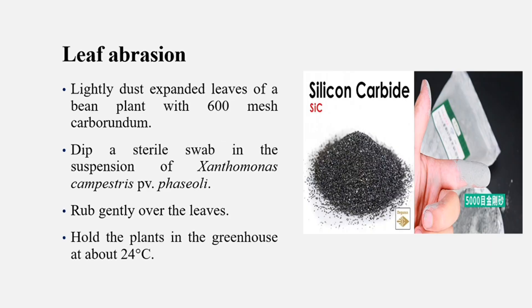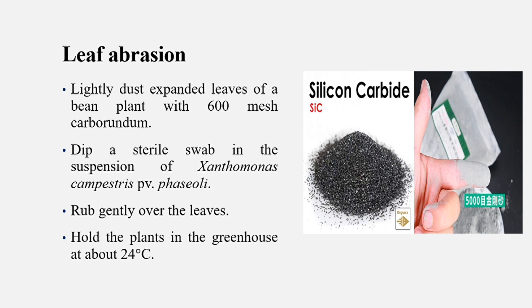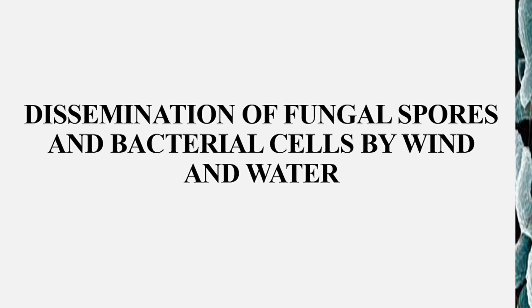The last method is leaf abrasion. We use mesh carborundum, which is silicon carbide, as an abrasive for cutting and gliding on the leaves. We then take a sterilized swab, dip it in the Xanthomonas compestris suspension, and rub it on the leaves. We put the plant in the greenhouse at 24 degrees Celsius and observe symptoms in two weeks.